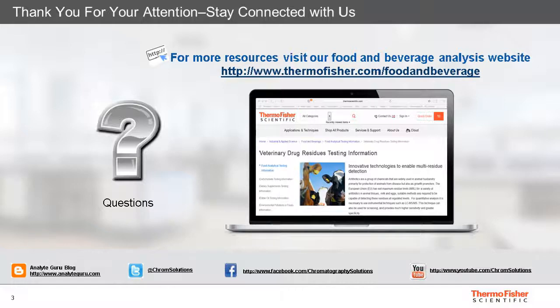Well, thank you, Richard, and perhaps you can answer this next question. Have you evaluated any online cleanup options? Yeah, well, this is a really great question. The simple answer is no, not in the case of this particular application. But since you already have the availability of switching valves, it should be possible, especially if you are interested in maybe a limited number of analytes in a particular matrix.